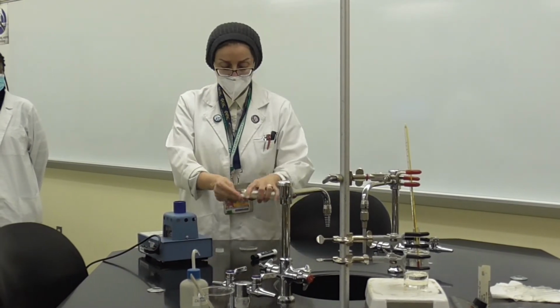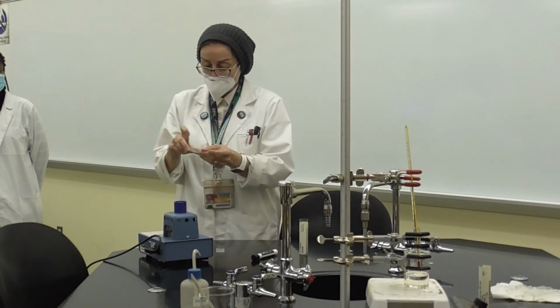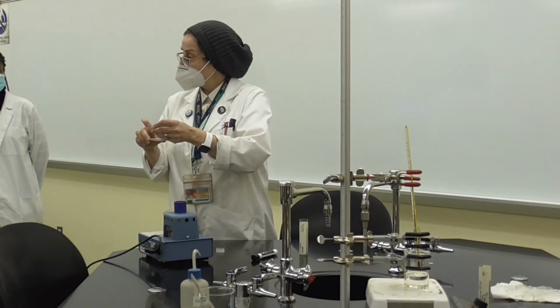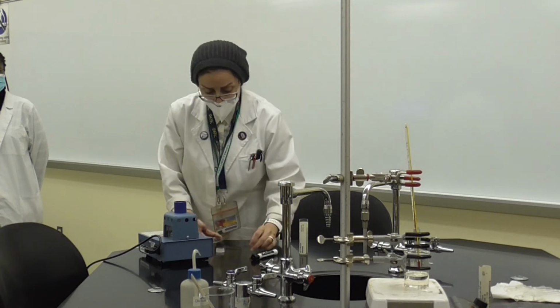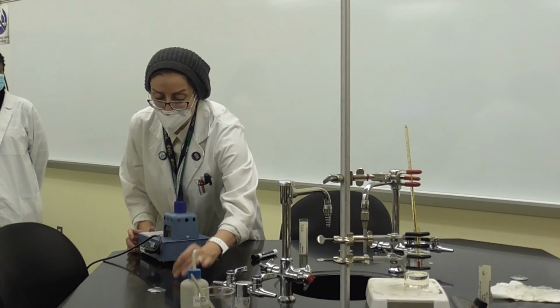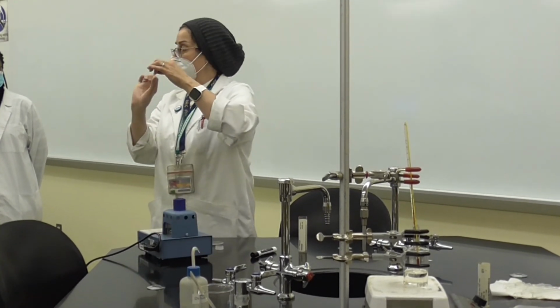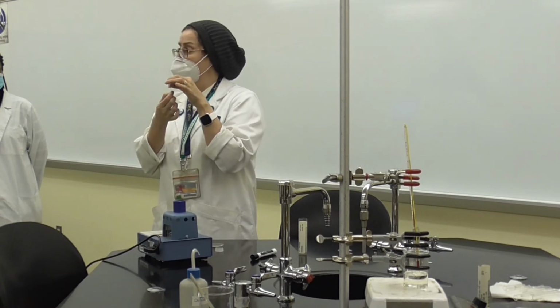And then I take the capillary tube and start to pack it with this chemical. It's very simple. I tap it, and the powder goes about 1 to 2 millimeters in height.